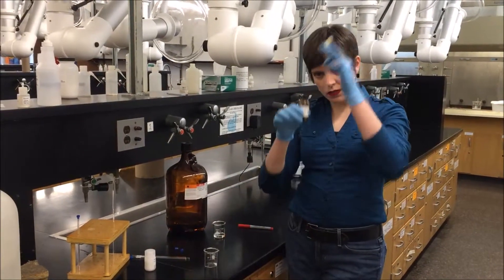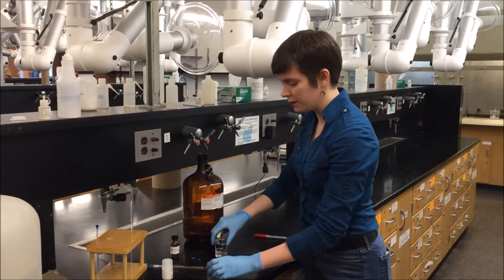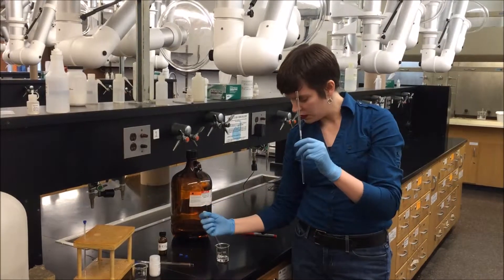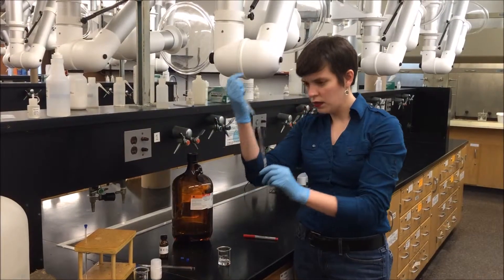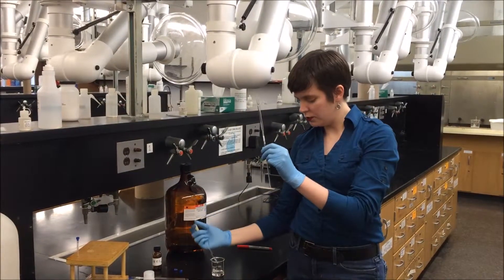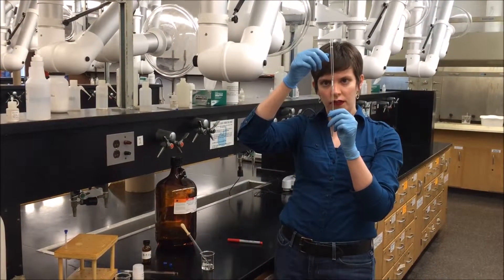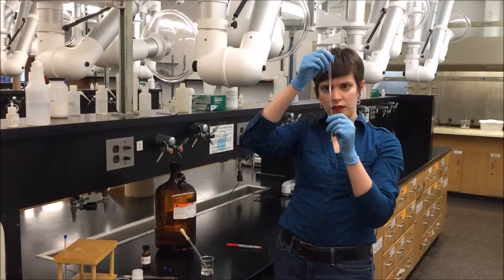Don't stick your pipette straight into the reagent bottles. Use a separate beaker — I have a little bit of chloroform in my beaker. Now I want to run my chloroform through this pipette to dissolve it into the NMR tube. I'm going to pull up a little bit, not a ton, and just run it in like that. I'm not adding too much because I want to let it dissolve the benzoic acid, and as it sits there I can see it's starting to dissolve and float up.